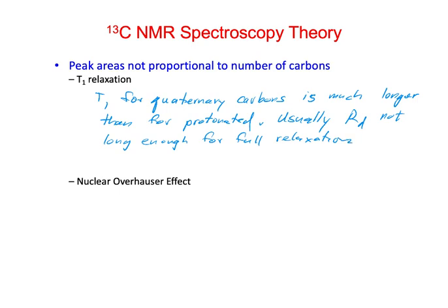And in general, for example, the T1 for something like a methyl group would be on the order of seconds, whereas a quaternary carbon could be up to minutes.